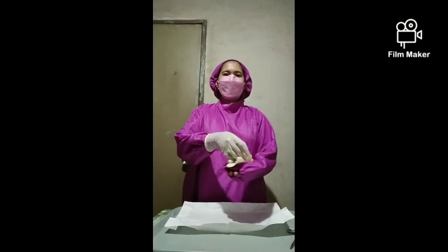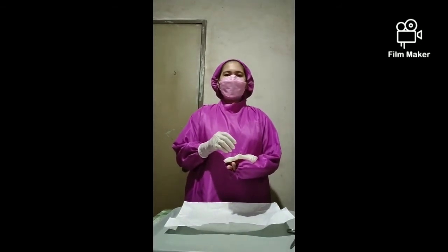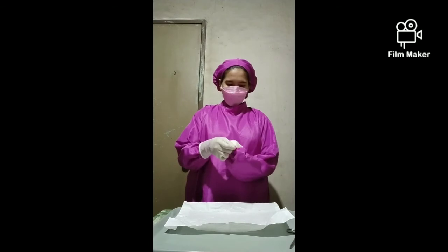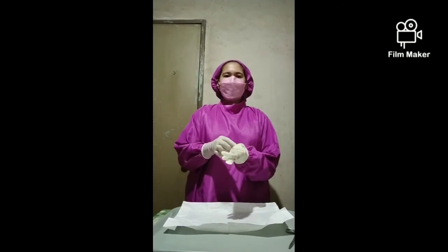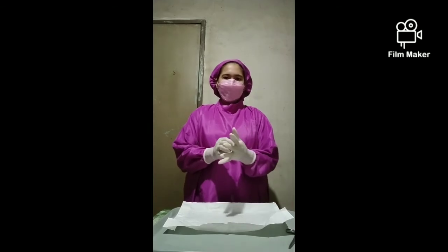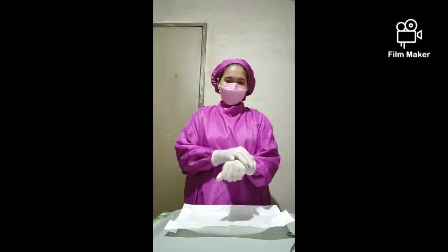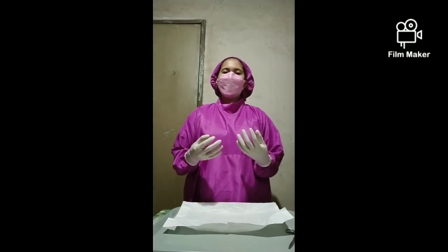Hold the left hand palm inside the gown and position the left glove over the left palm. Use the left hand inside the gown to grasp the fold of the glove cuff. Use the right gloved hand to grab the fold and pull the glove cuff over the gown cuff. Work the left hand into the glove, turn up and adjust the cuff. Reposition fingers as needed. This is to eliminate the potential hazards of contamination of the gloves.